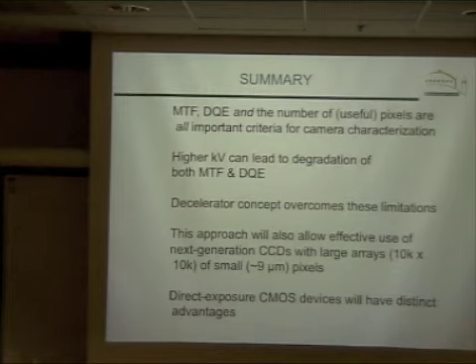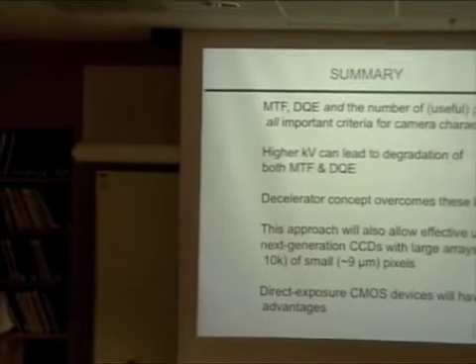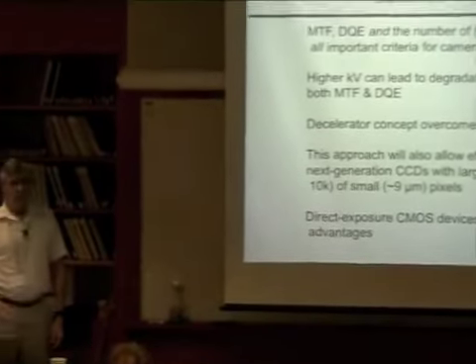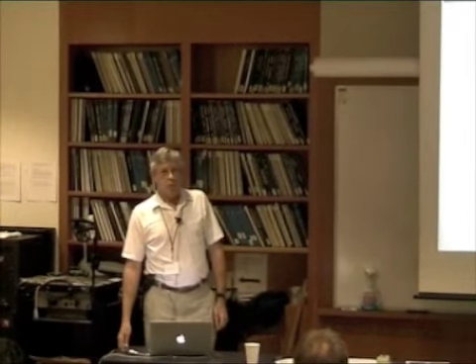In the lens-coupled systems, you have a thin scintillator that sits on a very, very thin substrate. And so there's no significant backscattering from that, and then the electrons just go through the substrate into vacuum. I don't know where they end up. Someplace that they don't scatter back up into the scintillator. Or if they do, they're distributed so uniformly they produce a very, very low intensity uniform background.